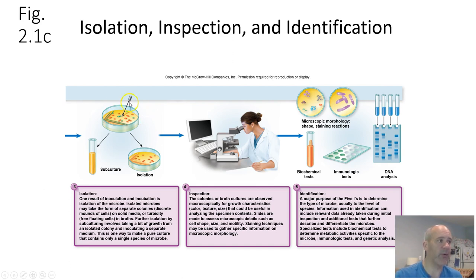And then you can sample. So you see those spots there on the petri dish, those are colonies of purified bacterial species. So you can then, using good techniques, sample bacteria from an isolated colony of those organisms on that plate and put that into a culture in a laboratory and grow up much larger numbers of that purified isolated species so that you can study it. Again, you're going to be hearing a lot more about this in your Learn Smart Laboratories activities.